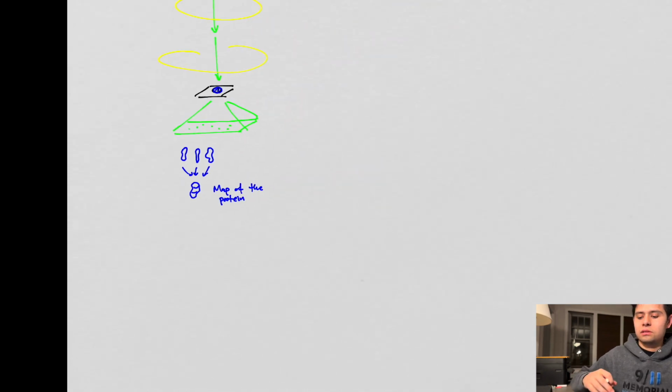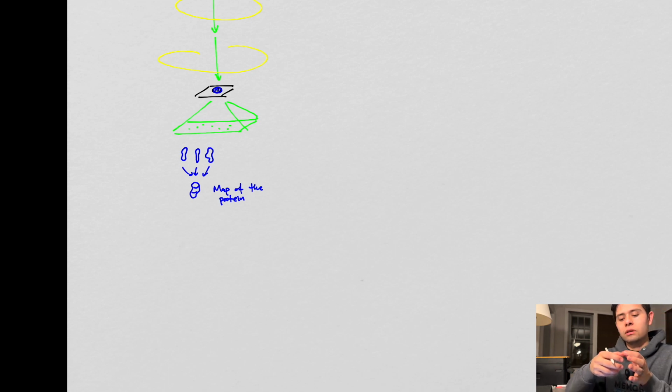There's a lot of mathematics that goes into it. There's a lot of computational stuff that goes into this. There's a lot of physics, again, that you have to understand. And we'll go into the details on this later. This is essentially what CryoEM is, though. You use electrons and you throw them at a frozen sample. That frozen sample consists of a lot of small particles in it that you're interested in studying. And then from those, you can take all the orientations, add them all up, and you get a map.